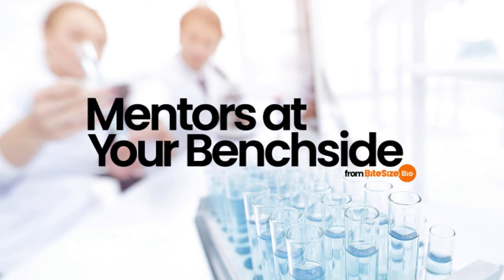Understanding accuracy and limitations in the lab is of the utmost importance to forming sound conclusions about experiments. This episode discusses accuracy and precision and provides concrete examples of ways to understand method limitations and improve measurements in your lab. So, what do we mean by accuracy and precision?